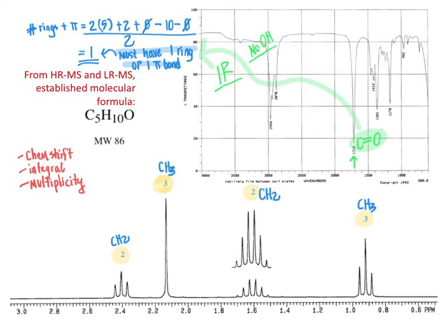So I'm going to start with the methyl group that is at 0.9 ppm. I'm just taking this CH3 group, sketching it out and labeling it as 0.9 ppm, and putting the letter T there to remind myself that that is a triplet. So we ask ourselves, what would we need in order to have a methyl group that is a triplet?